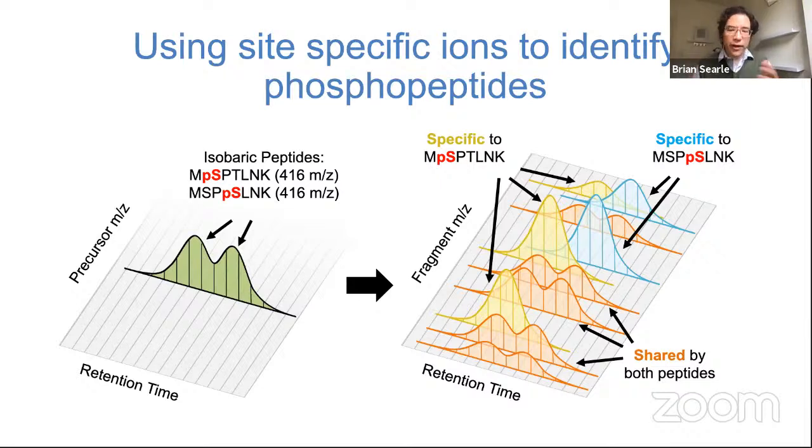There are lots of other types of modifications that can cause different types of problems in these circumstances that you can look at. For example, deamidation or oxidation can all sometimes exist within the same window.